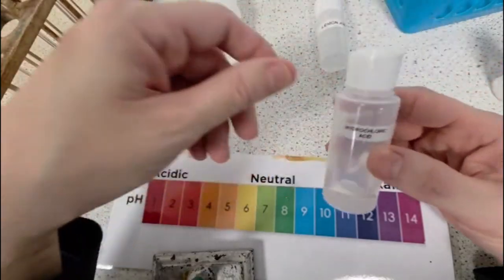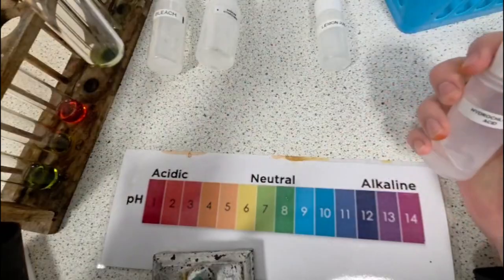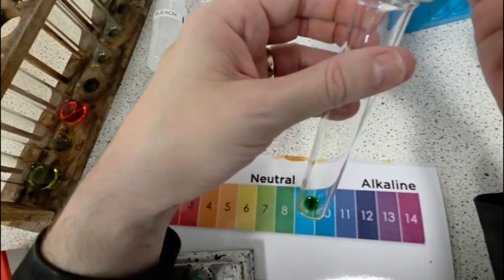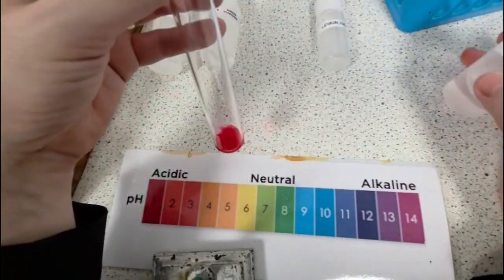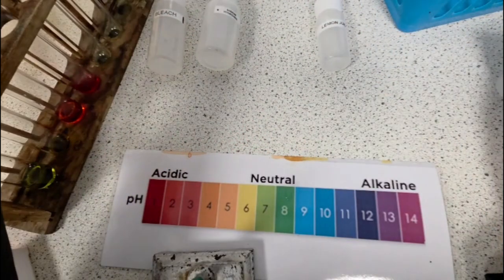We're going to try some hydrochloric acid. Now you probably have a very good idea of what color this will turn. Let's pop it in the tube and find out what color hydrochloric acid turns. So straight away, a very deep red color. It's probably a pH 1.